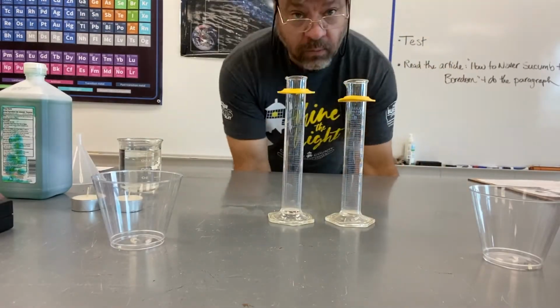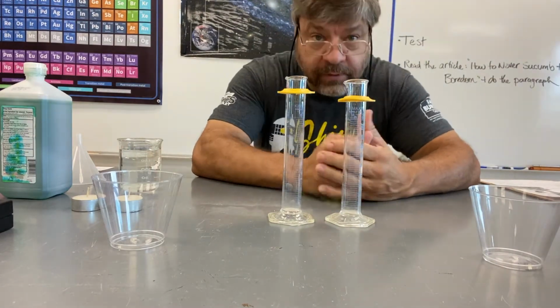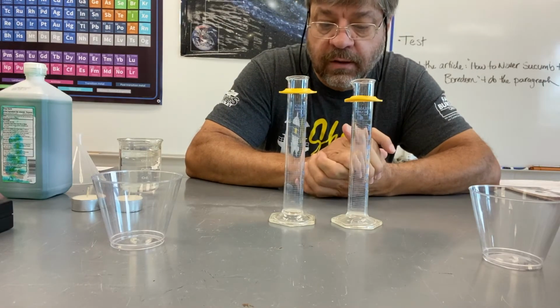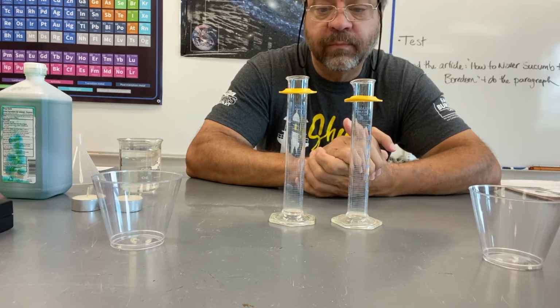Guys, welcome back to another one of our virtual labs. So today we are going to look at the densities of liquids and see how alcohol compares to water.